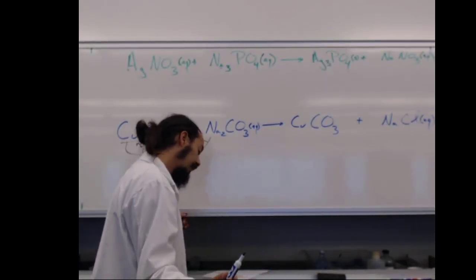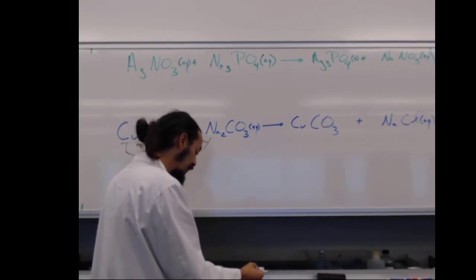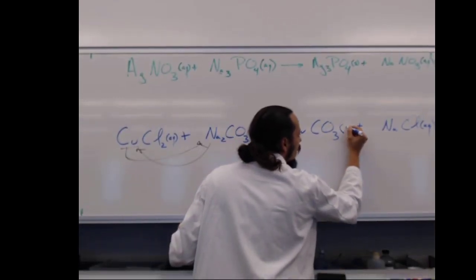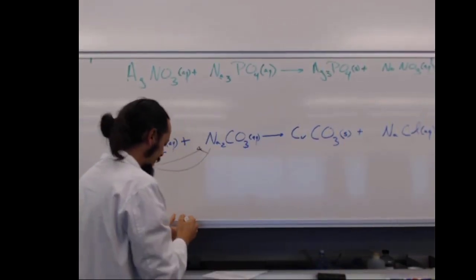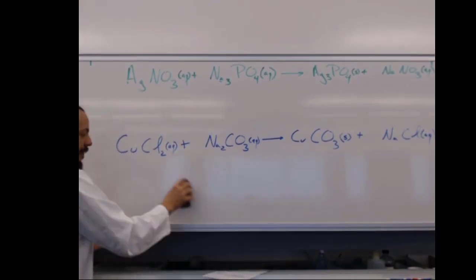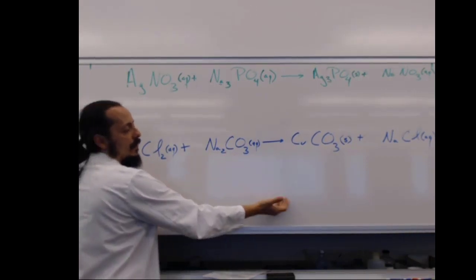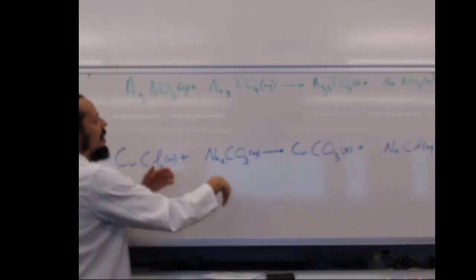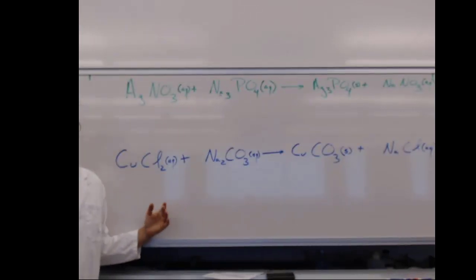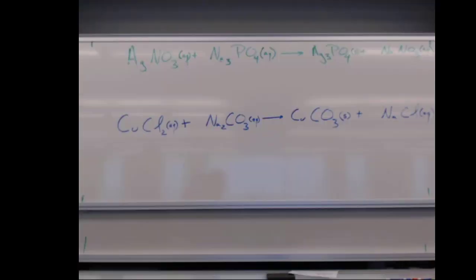According to our solubility rules, insoluble rule number 2 says carbonates are insoluble. So that should form a solid. This means in both of these reactions, adding together 2 liquids, we end up forming a solid. These are both referred to as precipitation reactions.